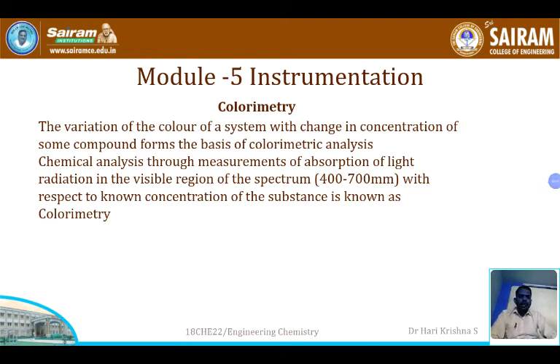Good morning. In our previous sessions, we discussed conductometric estimation and potentiometric estimations, and we have seen how to determine the amount of substance present by measuring conductance and potential of the reaction mixture. So today, the new method, colorimetry.